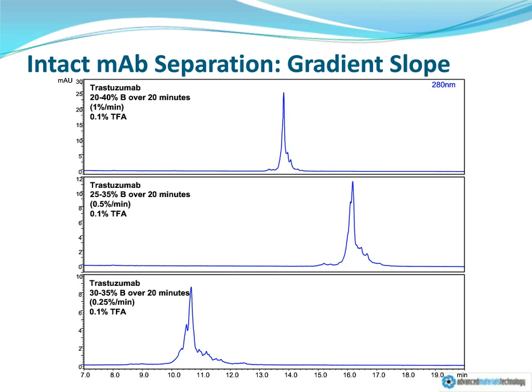At this point, we do not know what all of those variants are that we see in this TFA modified mobile phase separation, but it does identify that we should be concerned to not resolve things that potentially are not variants that we understand.